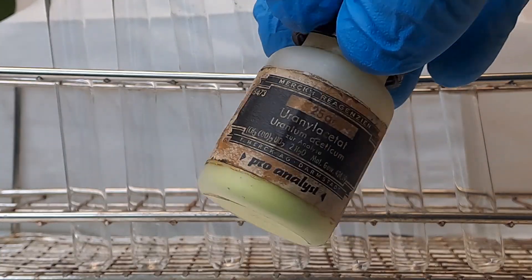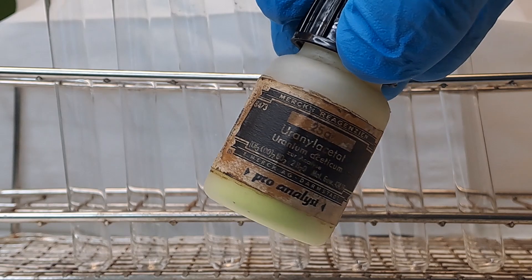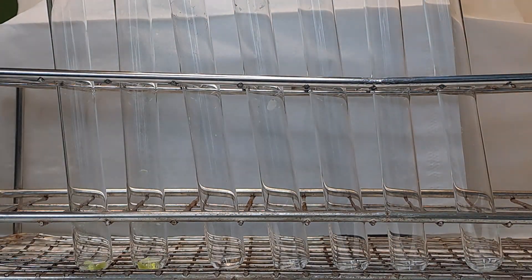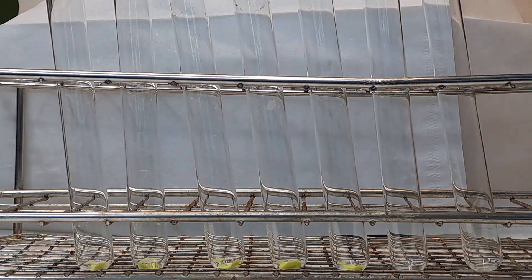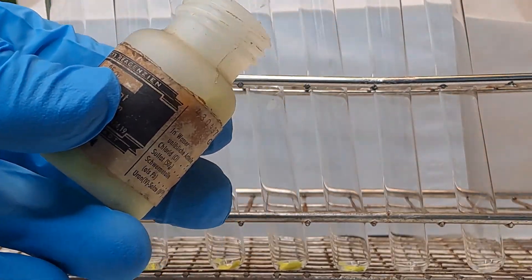Hello! Today we are taking a look at simple uranium chemistry in water. For this, a spatula tip of uranyl acetate was dissolved in distilled water. The uranyl acetate is somewhat old, as you can see from the container, and we simply have more of it than uranyl nitrate.